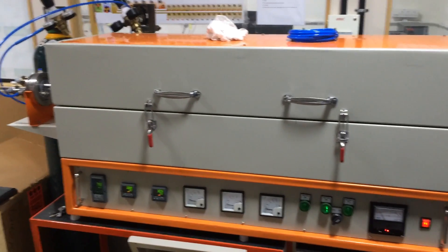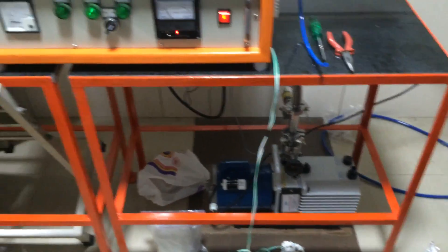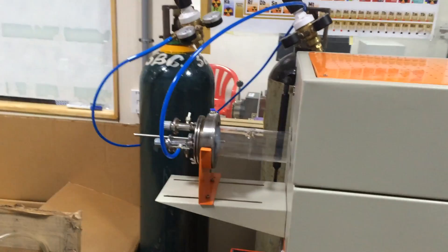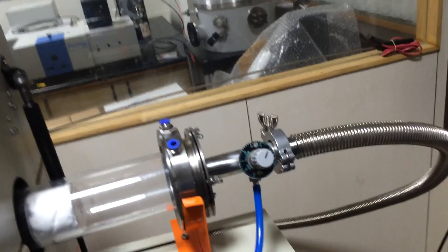Hey guys, this is our three-zone split tube furnace. You can see there is a vacuum setup also provided. This is a thousand-degree furnace. You can see the quartz tube inside, and there are three gases provided. One gas outlet.